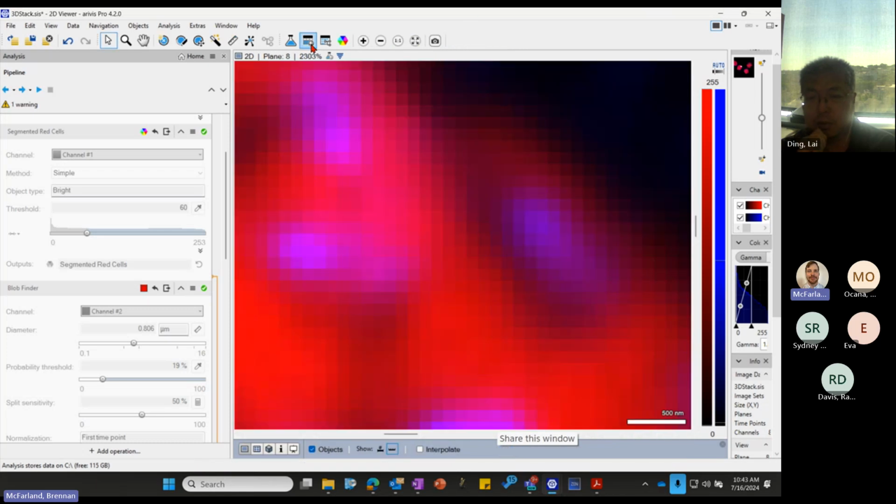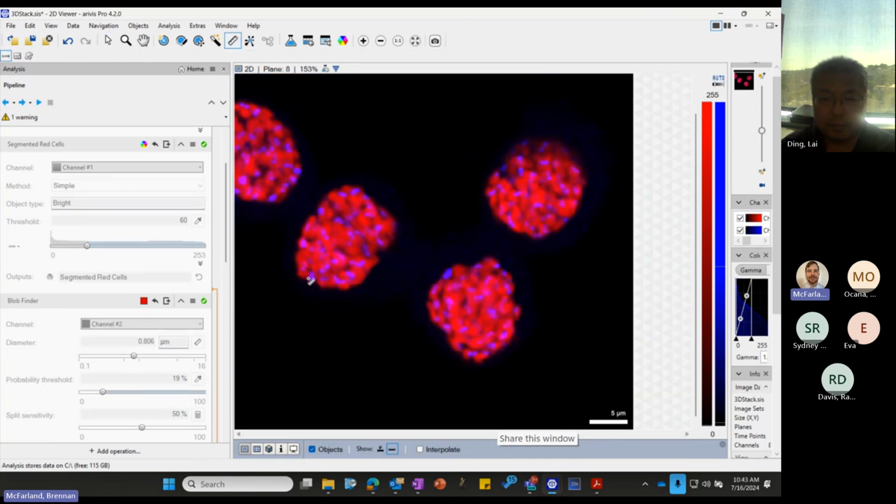And if I go and do a measurement, we only went up to 20, and the diameter of this is like 15. So it's going to kind of capture everything first. So it's going to say like these objects are going to be all falling within this 0 to 5 range because they're all contained within the object. This distances is really nice for cases where you want to find this object with respect to a further object away, where they're not contained within another.